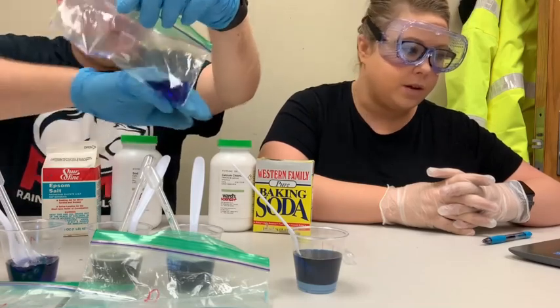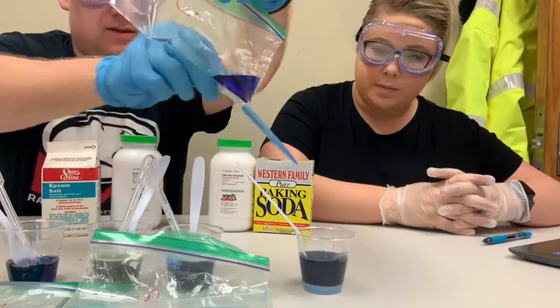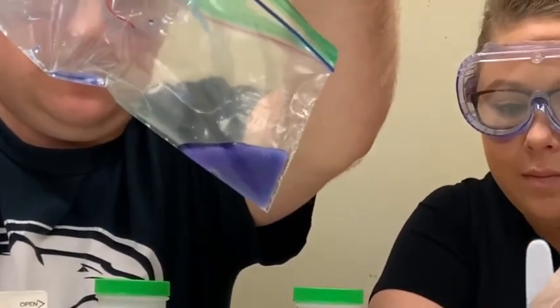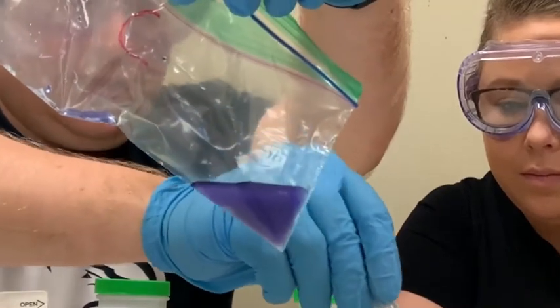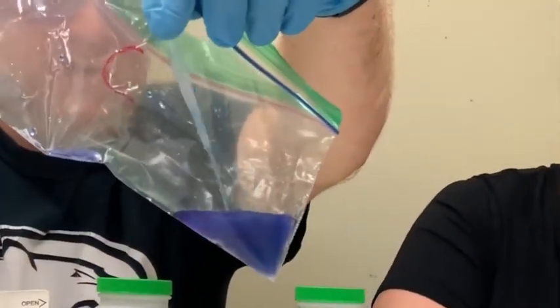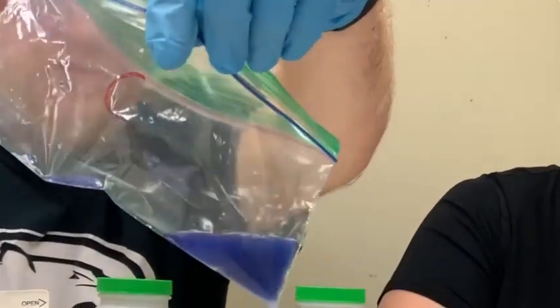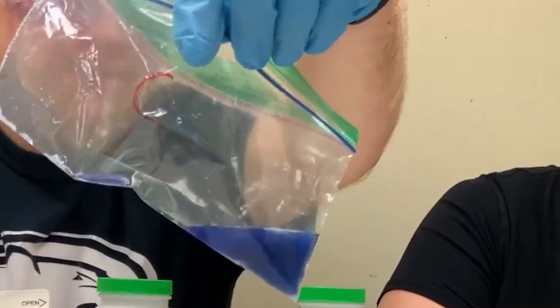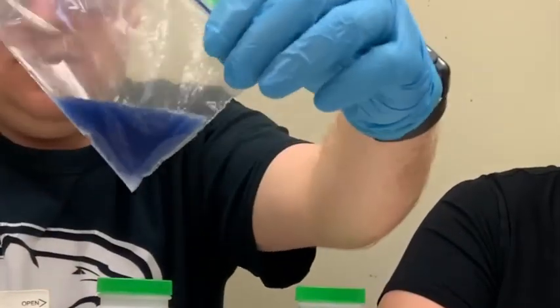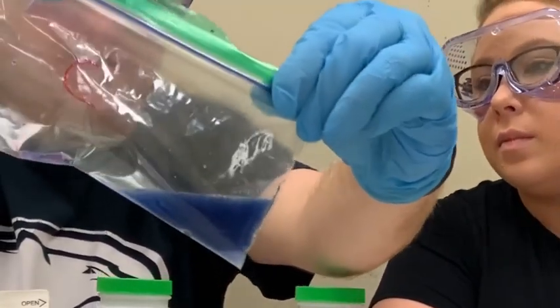And then sodium bicarbonate. Good call to mix that up. 2, 3. Good up here. I think I see a nice blue here.